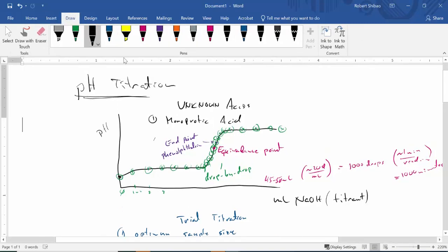And so ideally, if we could make this at 35 milliliters, then we need to slow down before 35 milliliters comes. Maybe a milliliter before, like 34 or 33.5 milliliters, we start to slow down. I drew way too many dots in here, but really it's only defined by about 2 or 3, maybe 4 dots. It rises so steeply that it's easy to miss.